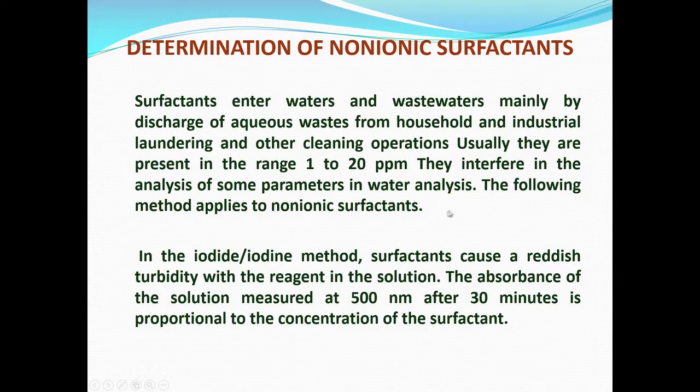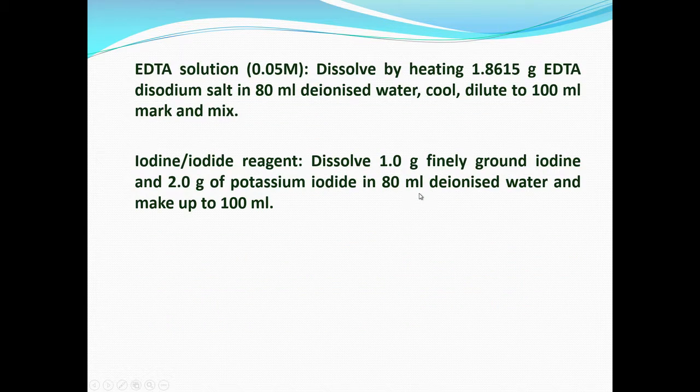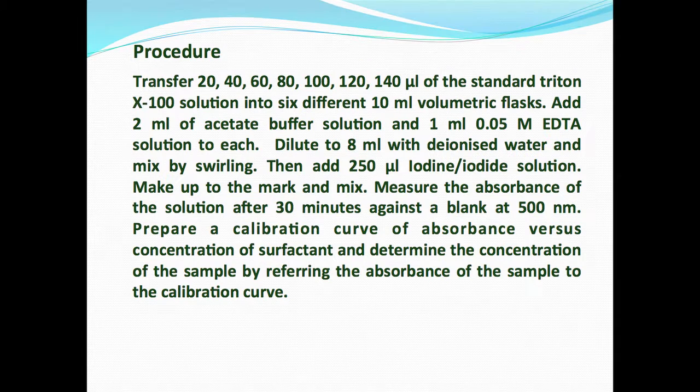Last class I was teaching you about the determination of non-ionic surfactants, and as I was telling you, nowadays there are surfactants entering everywhere in our water analysis. Without going into too much detail, I would like to show you this slide, and the next slide I had shown you the preparation of the reagents, and this is continuing in the same vein. We prepare all other reagents, and this is the procedure.